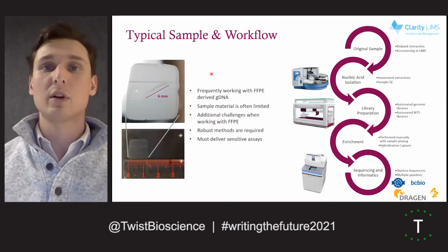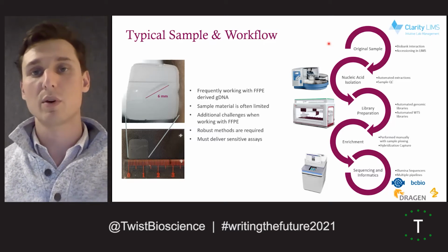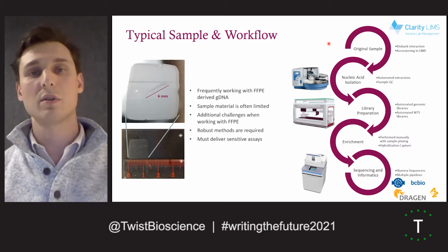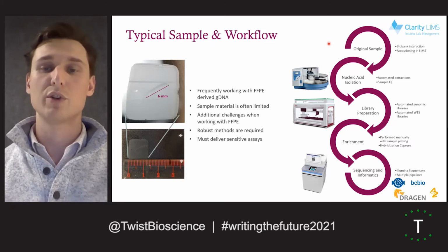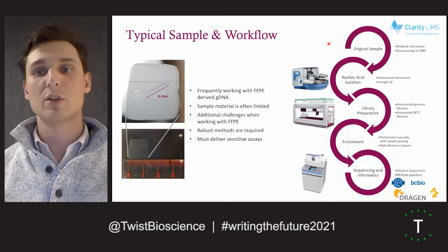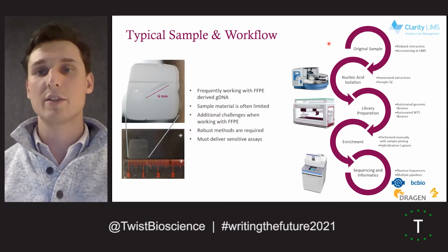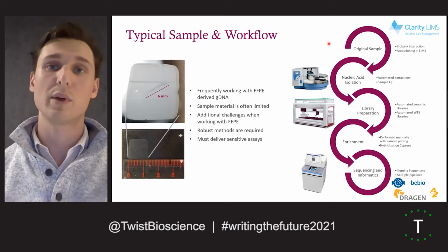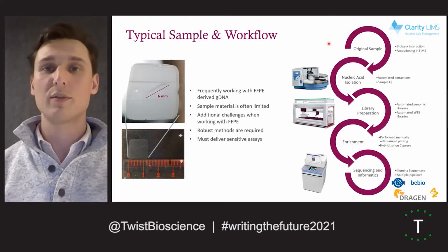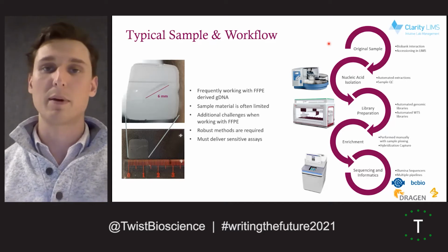So just to take a look at our workflow, we are a sample to sequencing lab hosted internally. So we perform nucleic acid isolation and library preparation leveraging some automation. We perform enrichment using Twist and competitors' hybrid capture methods, and that's generally performed manually with sample plexing to ensure higher throughput. And then we have a NovaSeq for sequencing, and we have 2 hosted informatic pipelines internally.